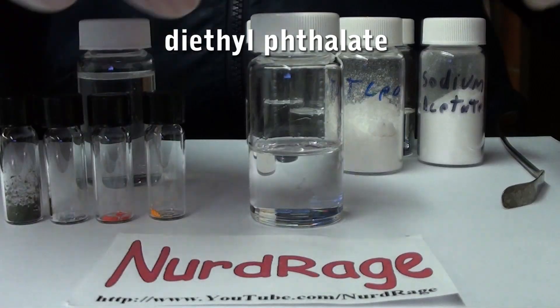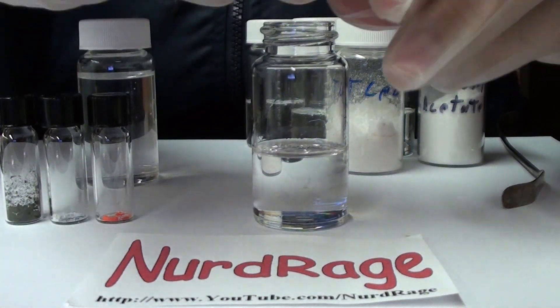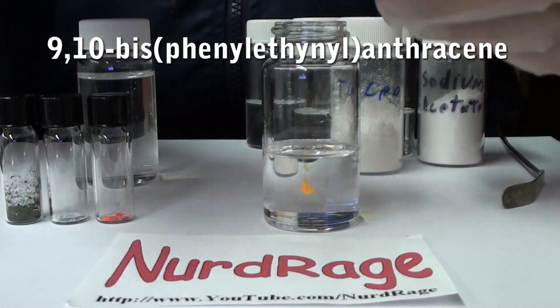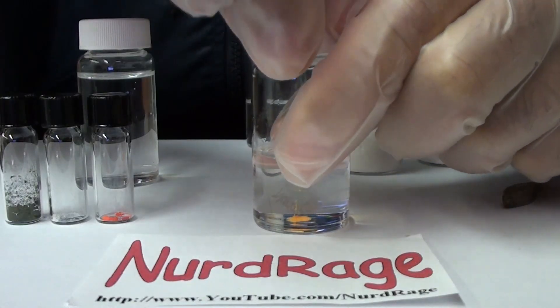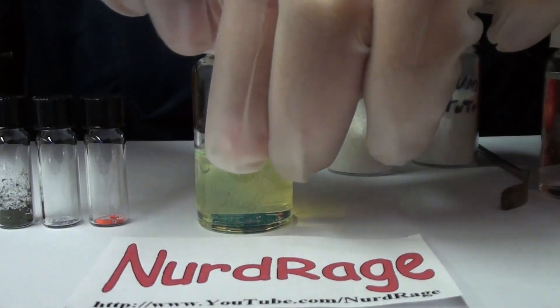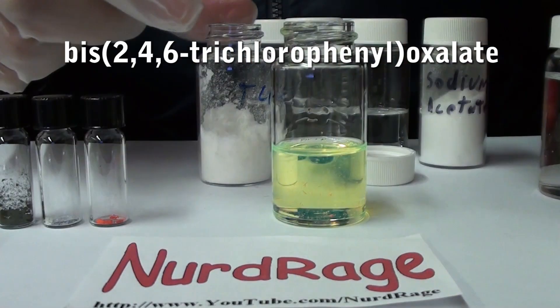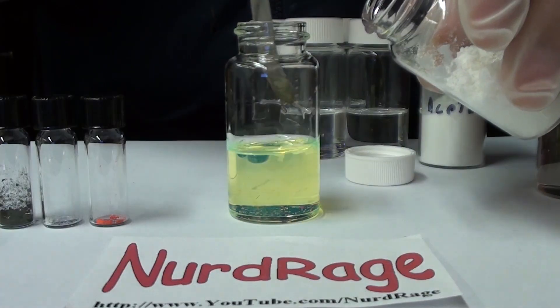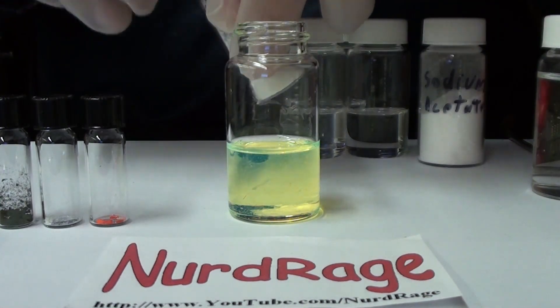First we start with a solvent, diethyl phthalate. We can't use water because some of the chemicals don't work in water. Now we add some dye to give it color. We're going to start with 9,10-bis(phenylethynyl)anthracene. It looks orange in the solid state but it dissolves to a green color. This will give us a green color for the glow stick. Now we add the key ingredient, bis(2,4,6-trichlorophenyl) oxalate, also known as TCPO. This is what makes glow sticks work — it provides just the right type of chemical energy to generate light when mixed with a fluorescent dye.